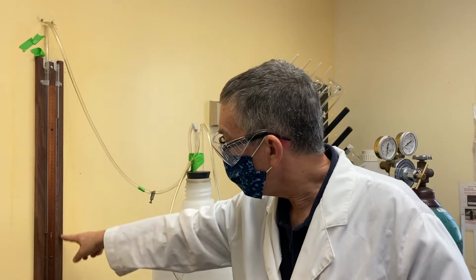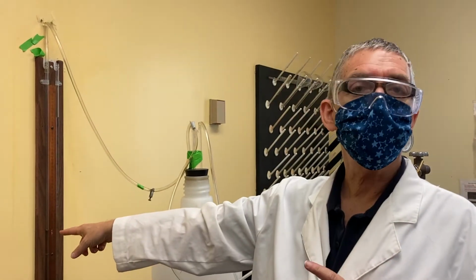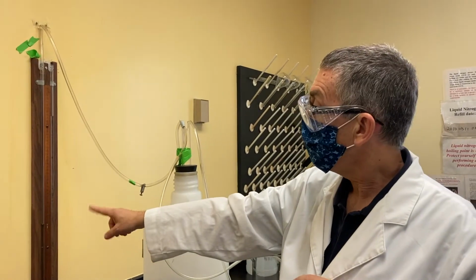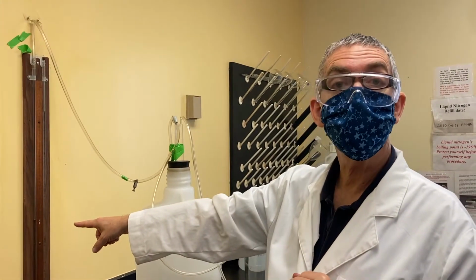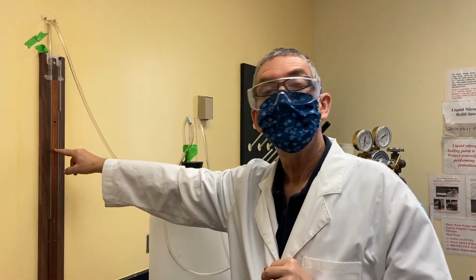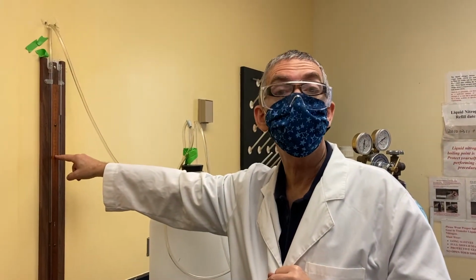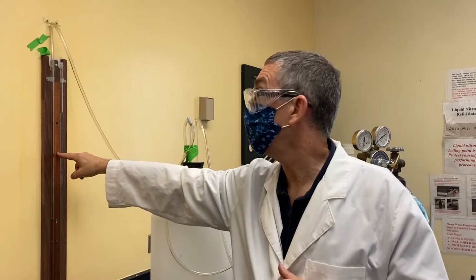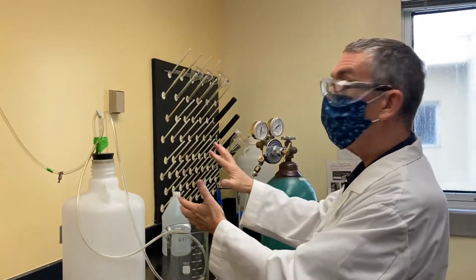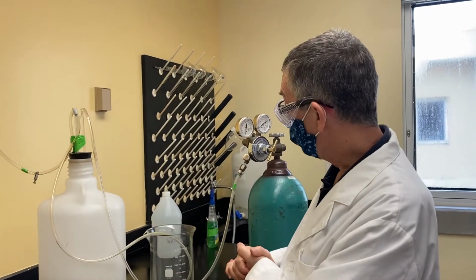This is filled with dibutyl phthalate, which is much lighter than mercury, much less dense than mercury. So when you convert a height here to millimeters of mercury, you will have to use a conversion factor, and that's all in the manual. So we'll use all of these pieces of equipment, okay?